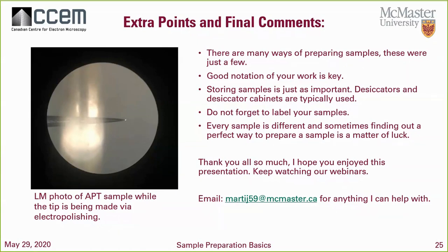I want to show you guys that picture here of an APT sample. Give a little shout out to Brian. The little light speckle is the interest area that he later on puts on the APT to study atoms.